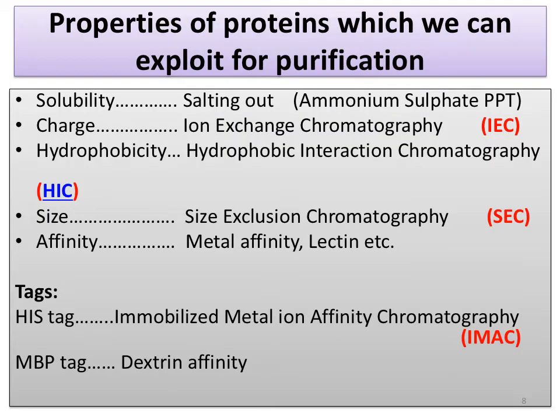Proteins could be purified by using chromatographic techniques on the basis of a variety of properties. One important property on which separation could be done is the charge of proteins. In this process, the proteins are separated by using a stationary phase which contains charges on it. This is called ion exchange chromatography.